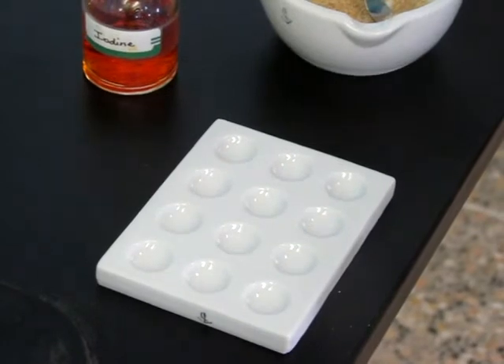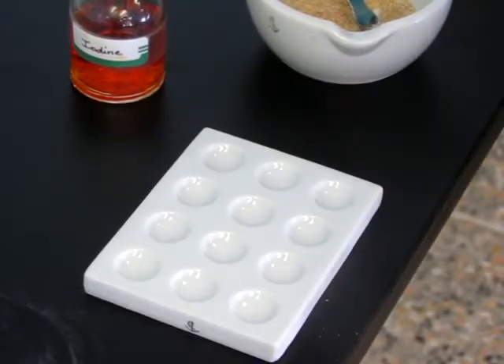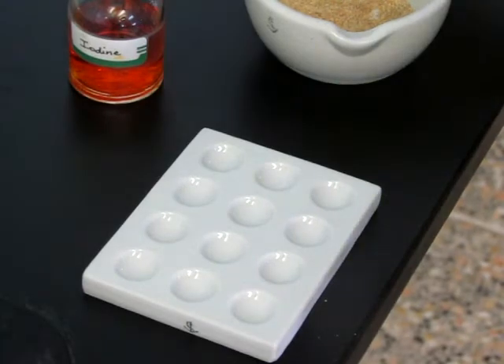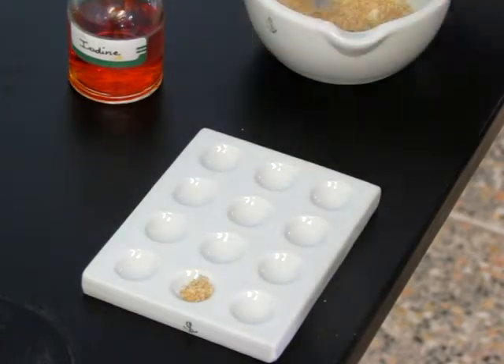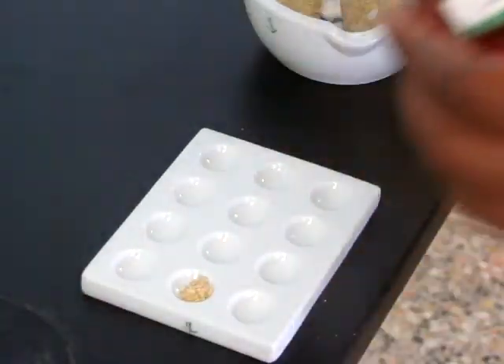This means that the feed chosen has a protein presence. We are now going to attempt the testing for starch, which is the iodine test. The feed has been finely ground. We will now place the sample of feed onto the tile.